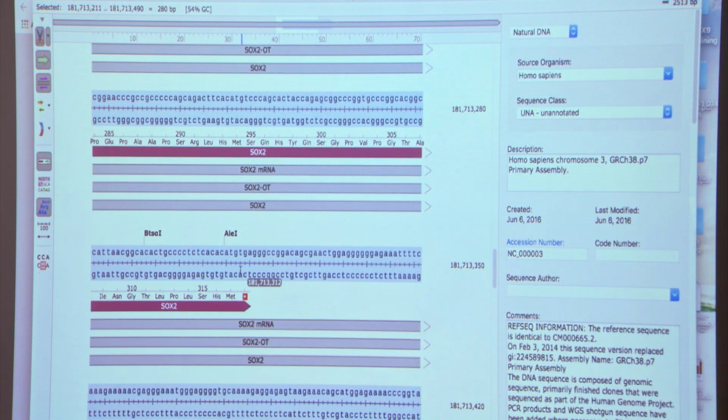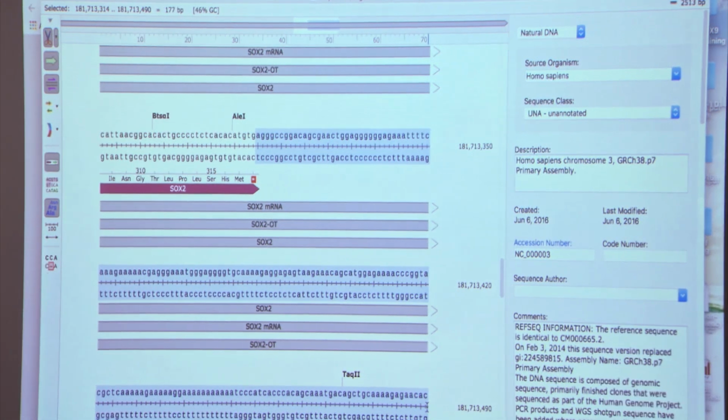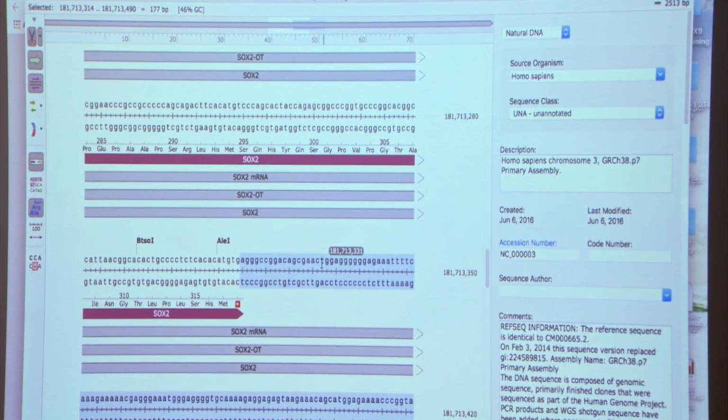You can also think about, so this is an example of a time when you could think about what your donor construct is going to be like. So for example, I could choose to take only the region in the 3' UTR because I want a donor that's not going to get cut by my guide RNA. And because the donor is already going to disrupt the 3' UTR, this would solve that problem automatically. It would be really easy to exclude those sequences from the donor, whereas if I have a guide RNA that's in the coding sequence, it's going to be more annoying to design a donor that doesn't have the guide RNA in it.